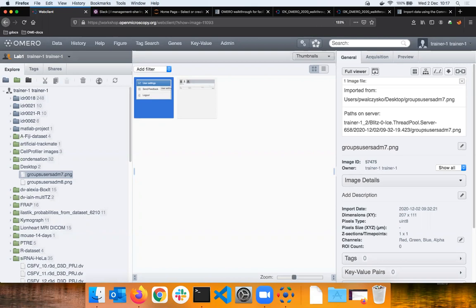In many cases, you have a student coming to the lab, they do some acquisition, they leave the lab. You do not want to lose that work. You want to pass it on to somebody else, because depending on the level of permission, it's only the student who will, for example, be allowed to delete certain things. Since that person is not there, you want to pass it on to the person taking the project on. We offer a lot of flexibility like that, so you don't have to start from scratch again. You can pass it on and keep that knowledge.